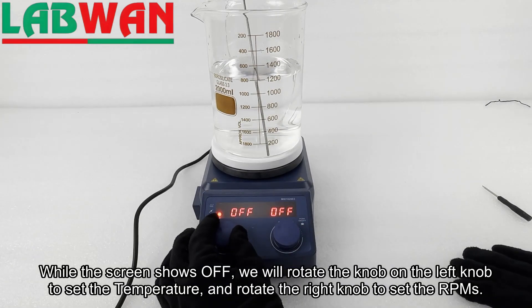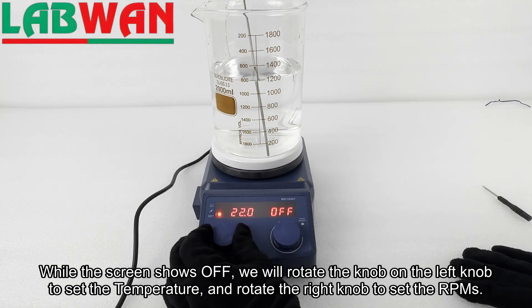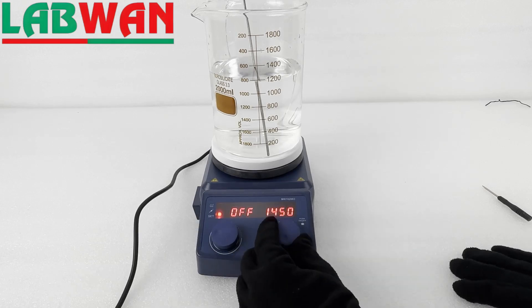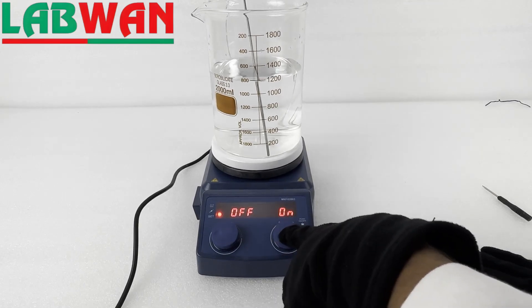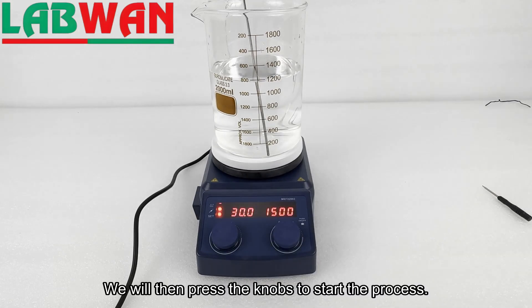While the screen shows OFF, we will rotate the left knob to set the temperature, and rotate the right knob to set the RPMs. We will then press the knobs to start the process.